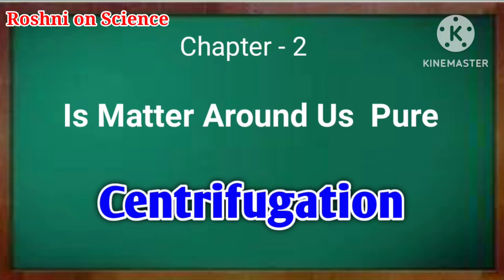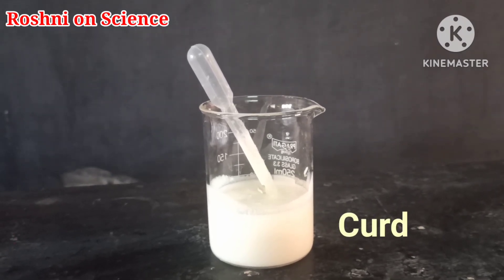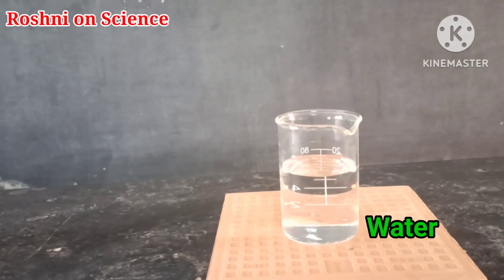How we can separate butter from curd using the centrifugation method. For this experiment we need curd and water.